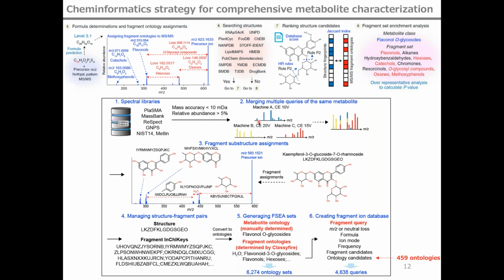Moreover, multiple spectrum records of the same metabolite coming from different instruments or mass spec conditions are integrated into one metabolite record based on the assigned molecular formula and assigned fragment formula.